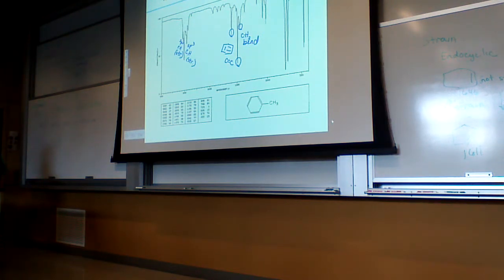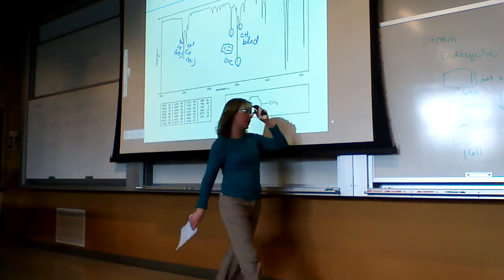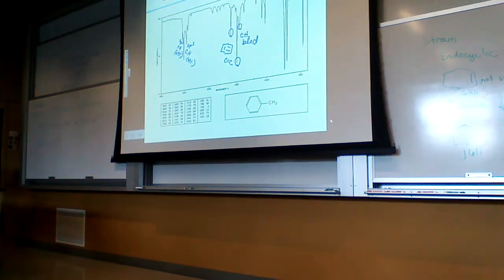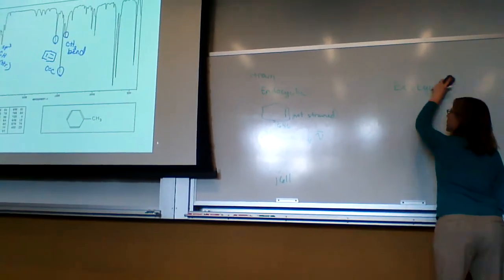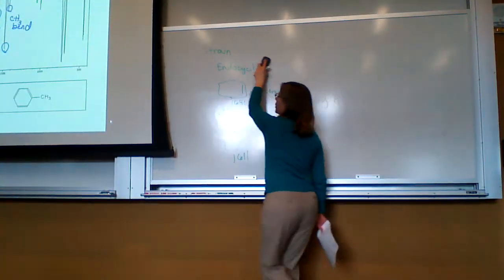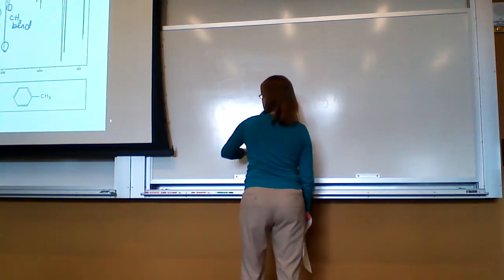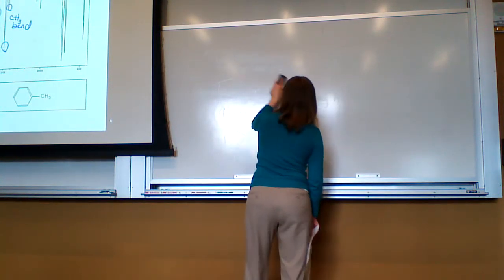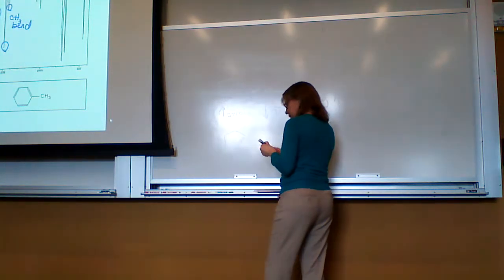The next part we want to look at is the CH bending. There's a nice table in your book and a chart, so I'll refer you to that. But essentially, you can look at a certain region of the IR spectrum to tell you about what the substitution pattern is on your aromatic ring. This depends on how complicated your fingerprint region is.